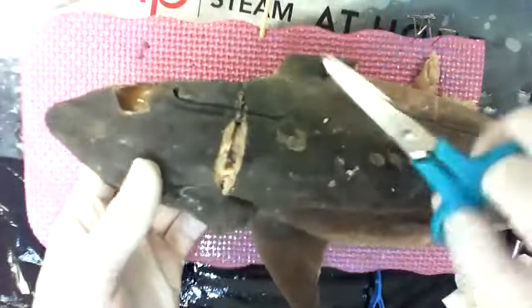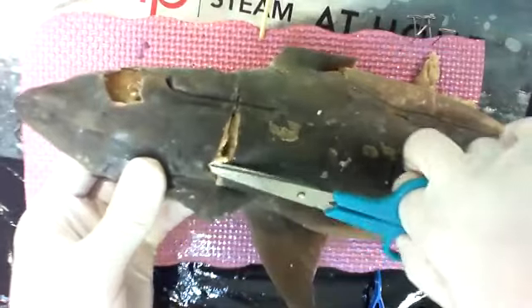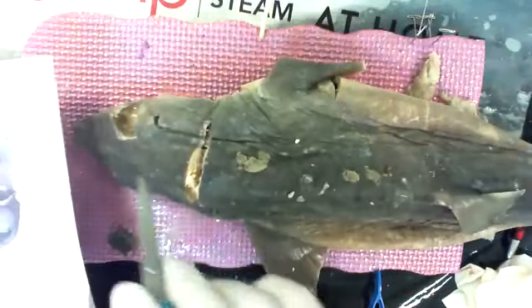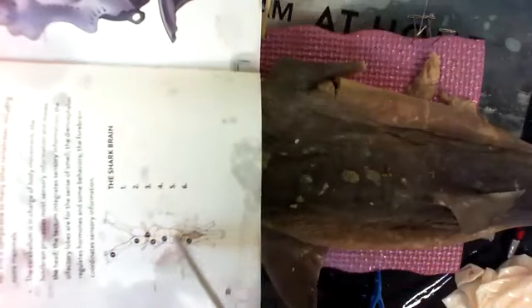Right? So that can get down to the vertebra and the spinal cord. And then if you want to get to the brain, you can do that whole skinning thing, going like this. So you can go from this perspective forward. There's the skull, right? So you're going this way. Or you can go above the eye here and come back. There's the skull, and there's where the brain is kept. Here's actually the brain itself.